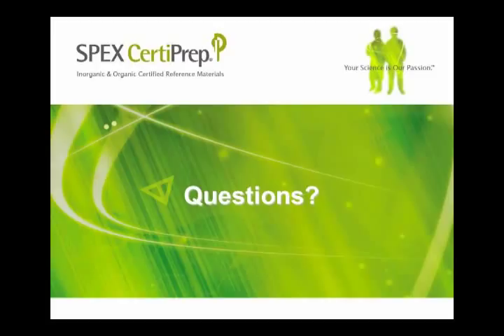And how does one find K, or the coverage factor? If your observations are less than 7, you go to the Student's t. Student's t is available in any statistics book, or I can email you that. Okay.